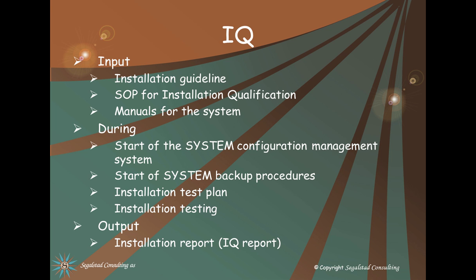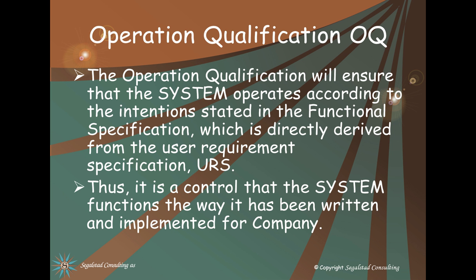The input to the IQ is the installation guideline, if we have any, an SOP for installation, manuals for the system. And what we're doing during the IQ phase is we start the system and configuration management. We start the system backup procedures. We have an installation test plan, and we do the installation testing. And the output is the installation report.